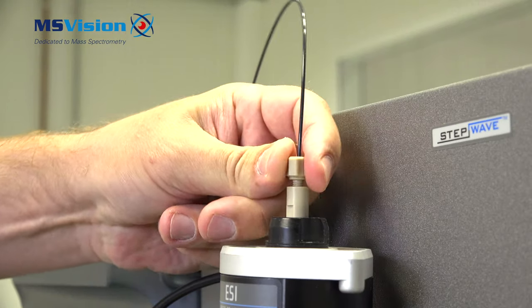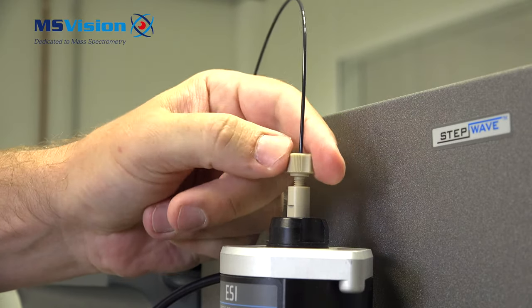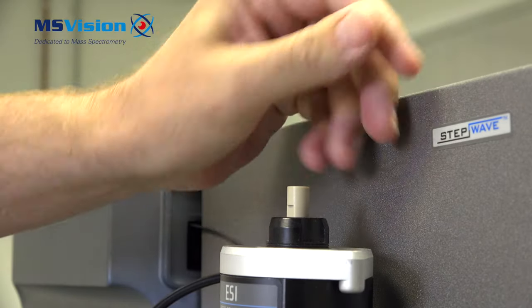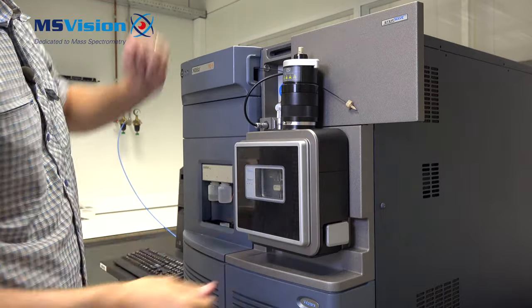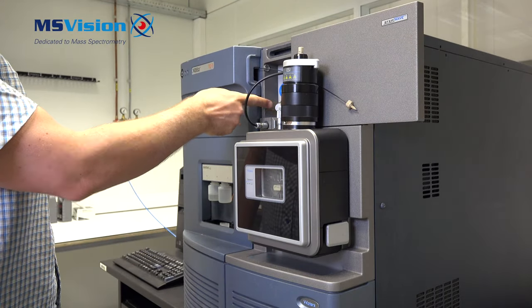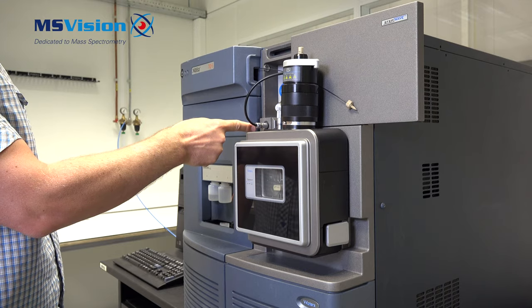First, disconnect the inlet connection which is on top of the probe. Then slide open the door. Behind here there's a large fissure connector and a small fissure connector for the capillary voltage.